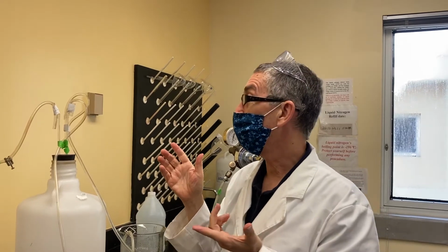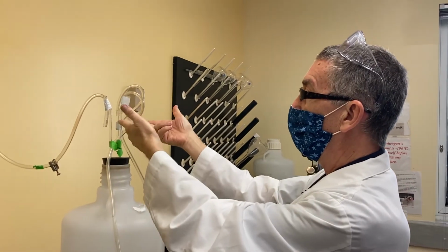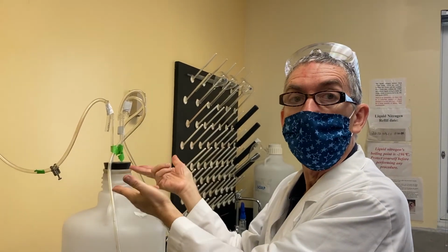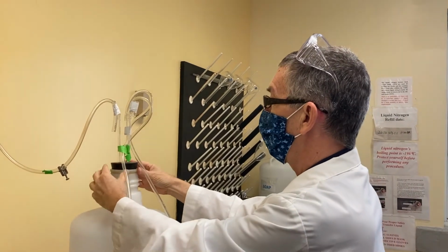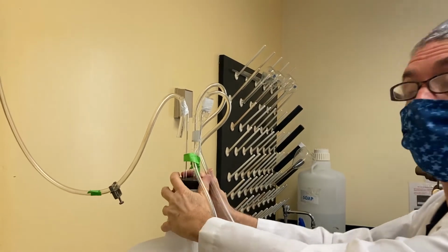What about P2? What do we do next? Next we're going to raise up the stopper a few inches and lower it. Okay, a rapid but smooth motion and reproducible. So I will show you roughly what to do. That's all there is to it.